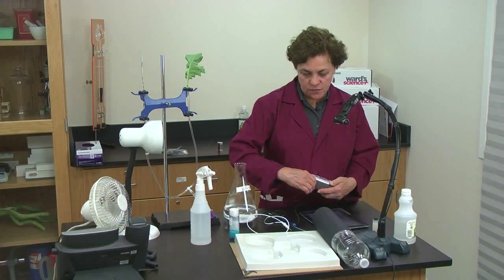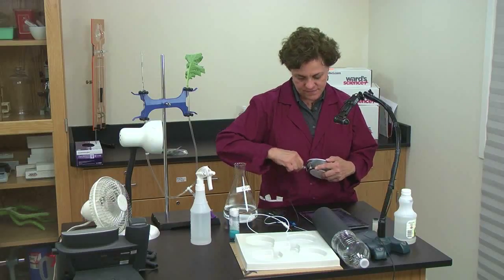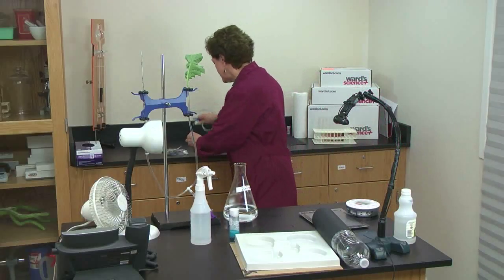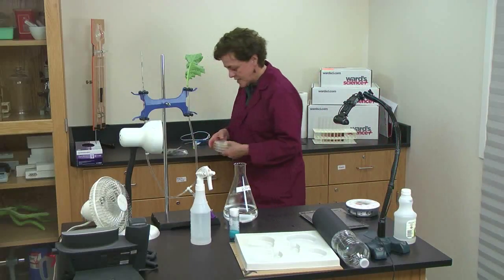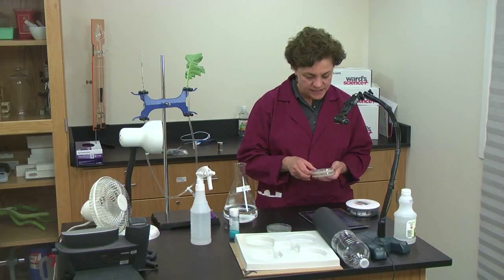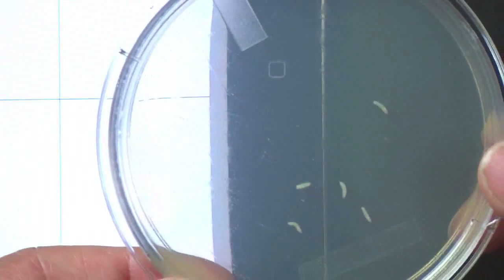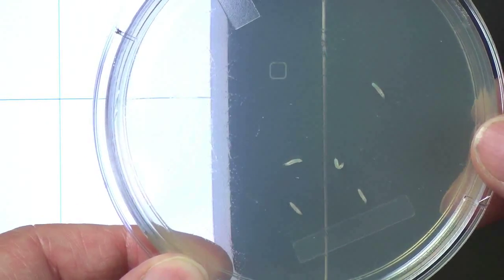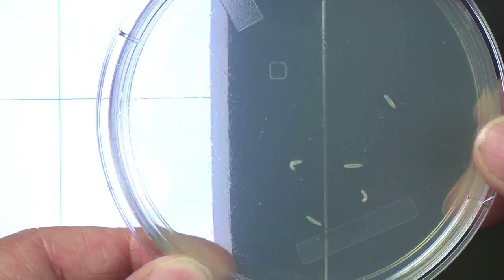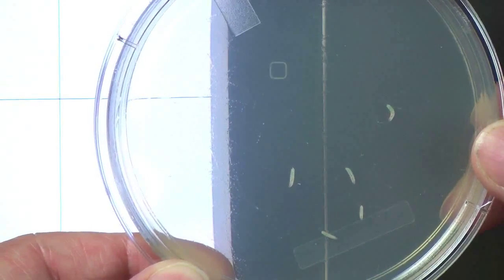All right, what we've added along with this now is College Board suggested that you also test not only the adult flies, but you actually test, there we go. If you can see, there's some larval forms. So you can do the same sort of experiment on the adult flies as you do the larvae, or maggots if you really want to say it.